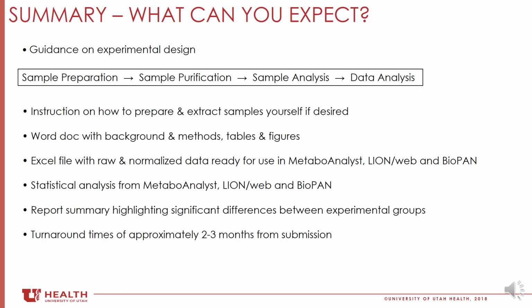And finally, turnaround times can vary widely depending on just how busy we are at the core. Approximately 2 to 3 months from sample submission is pretty close to normal.